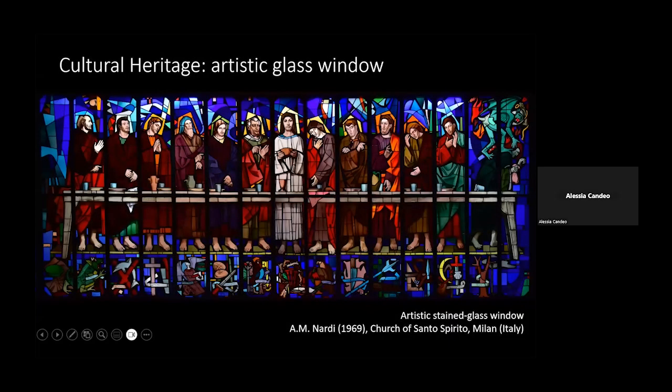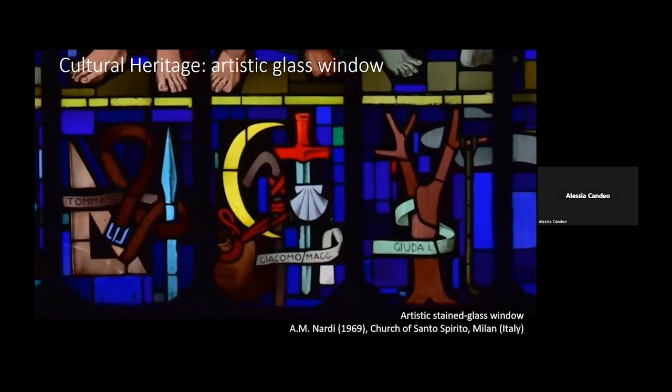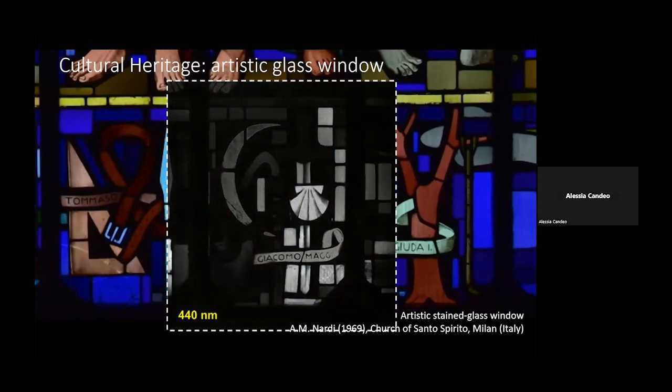It is also possible to perform a study with transmitted light, so transmitted light hyperspectral imaging. For example, we studied this artistic glass window. We went to the Church of Santo Spirito in Milano with the camera, and we focused our attention on this detail of the glass window.